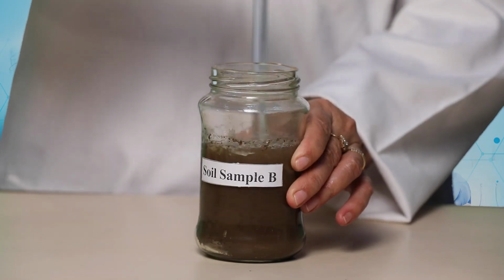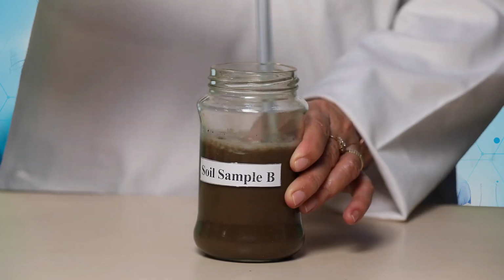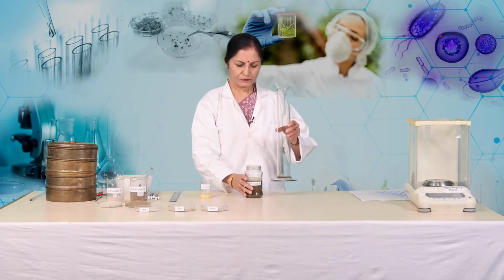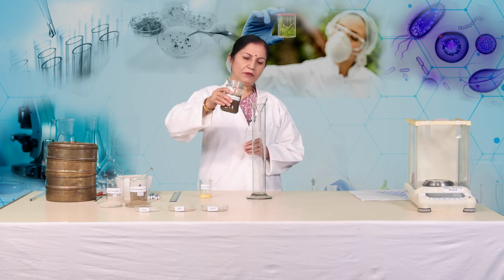Now, we stir the mixture thoroughly. We pour this mixture in a measuring cylinder.